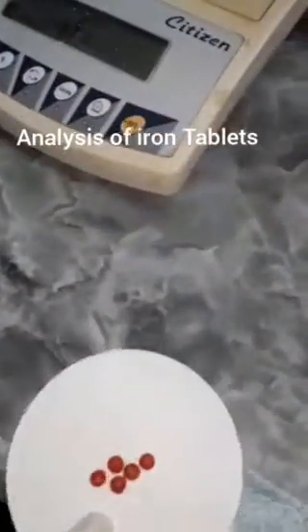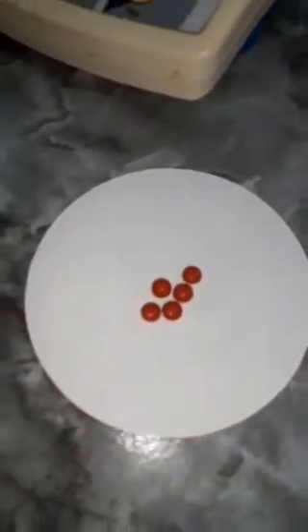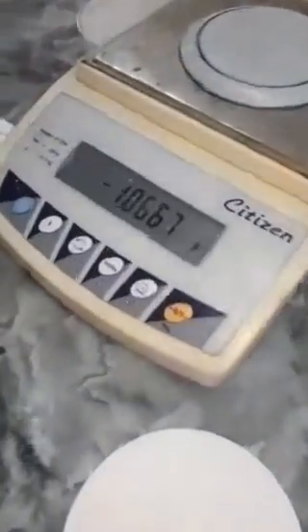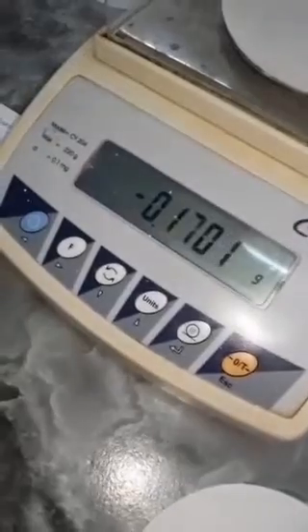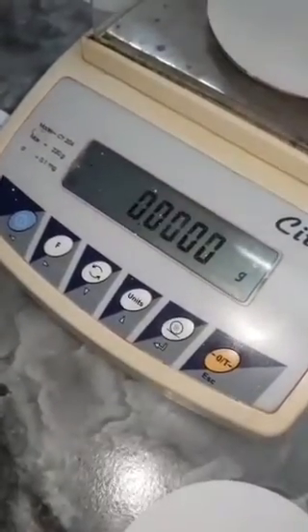Okay, so the first step, we're going to weigh the 5 tablets of iron. We'll put a filter paper on the balance. First we'll switch it on. It's on. We'll put a filter paper on the balance. Then we're going to zero it. Then we'll weigh the tablets, the 5 tablets.